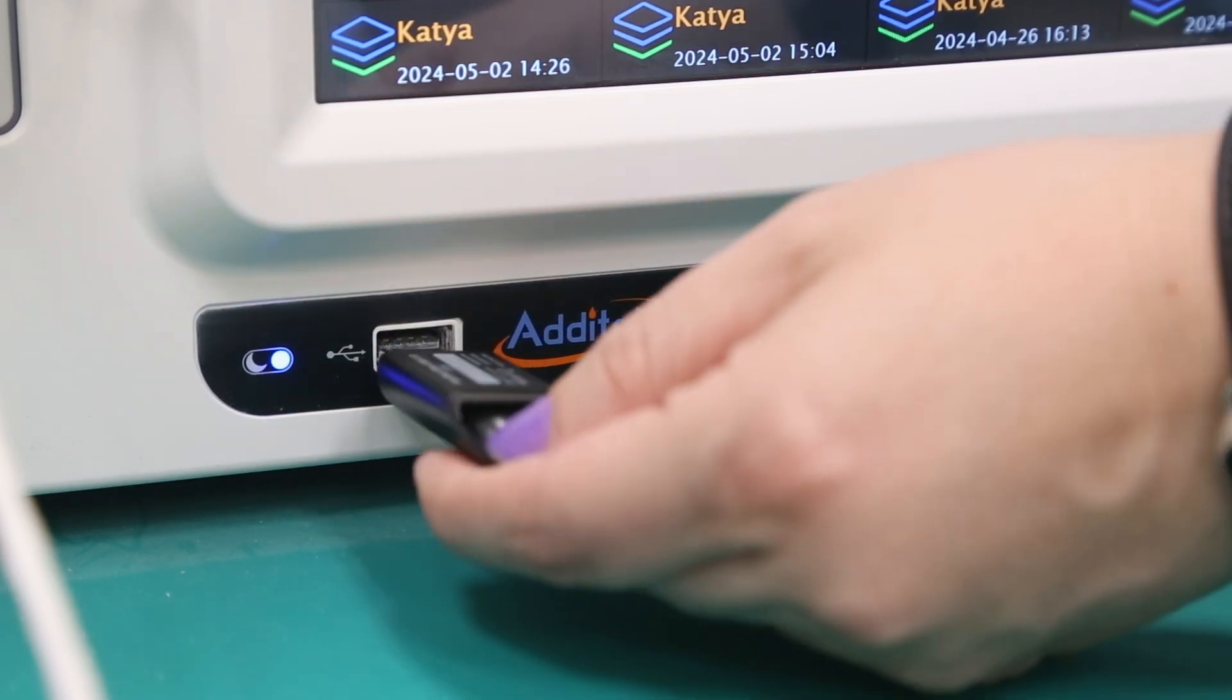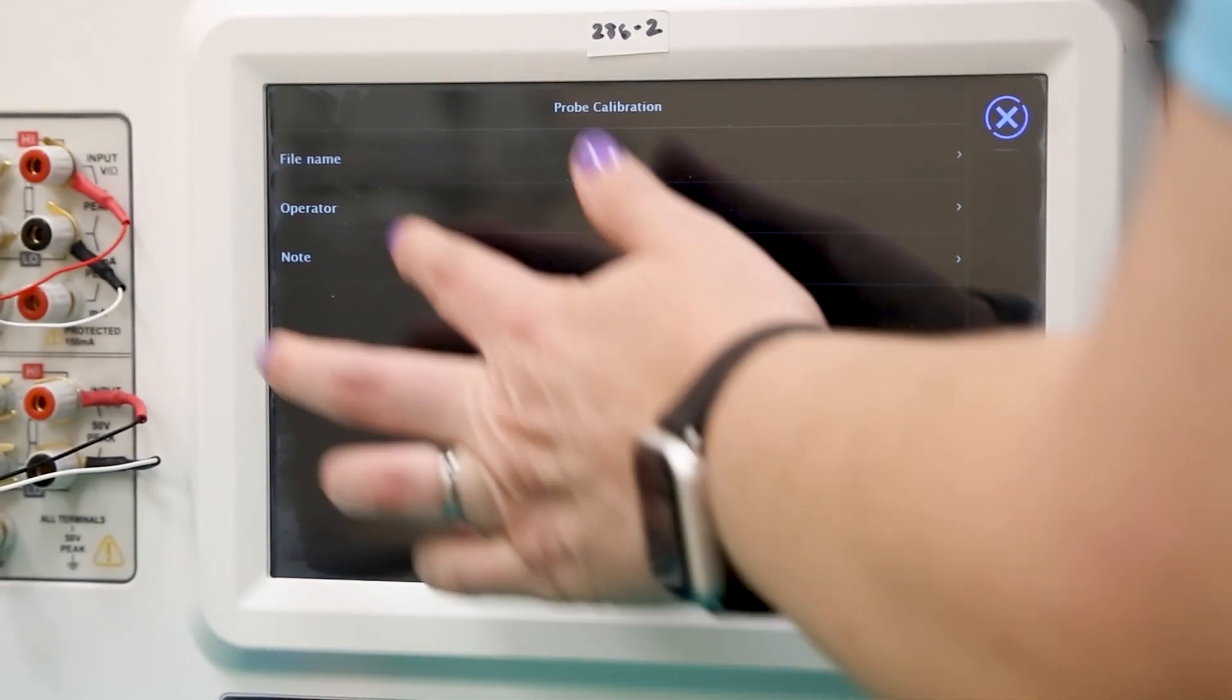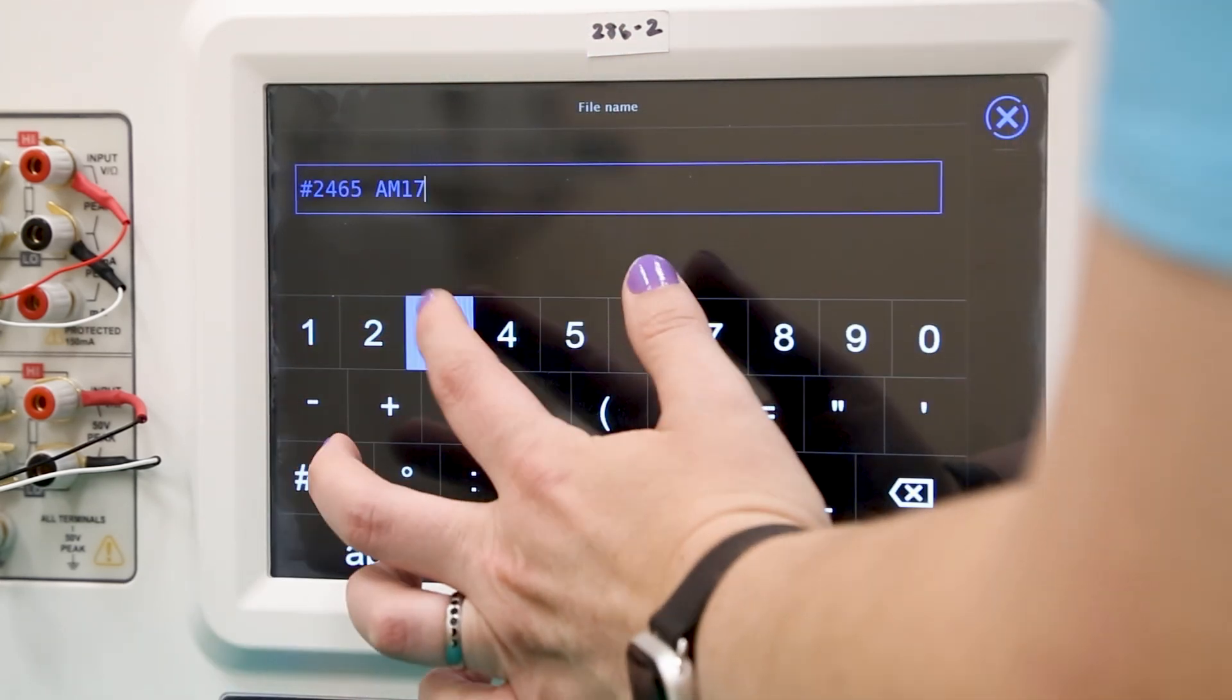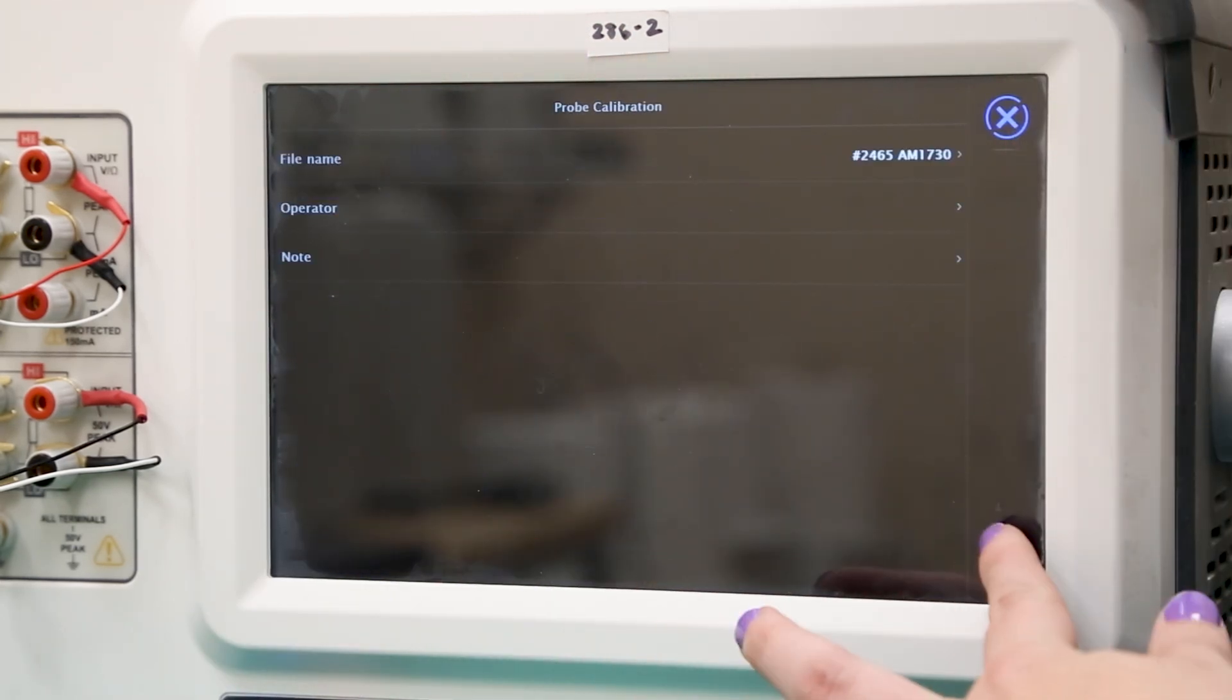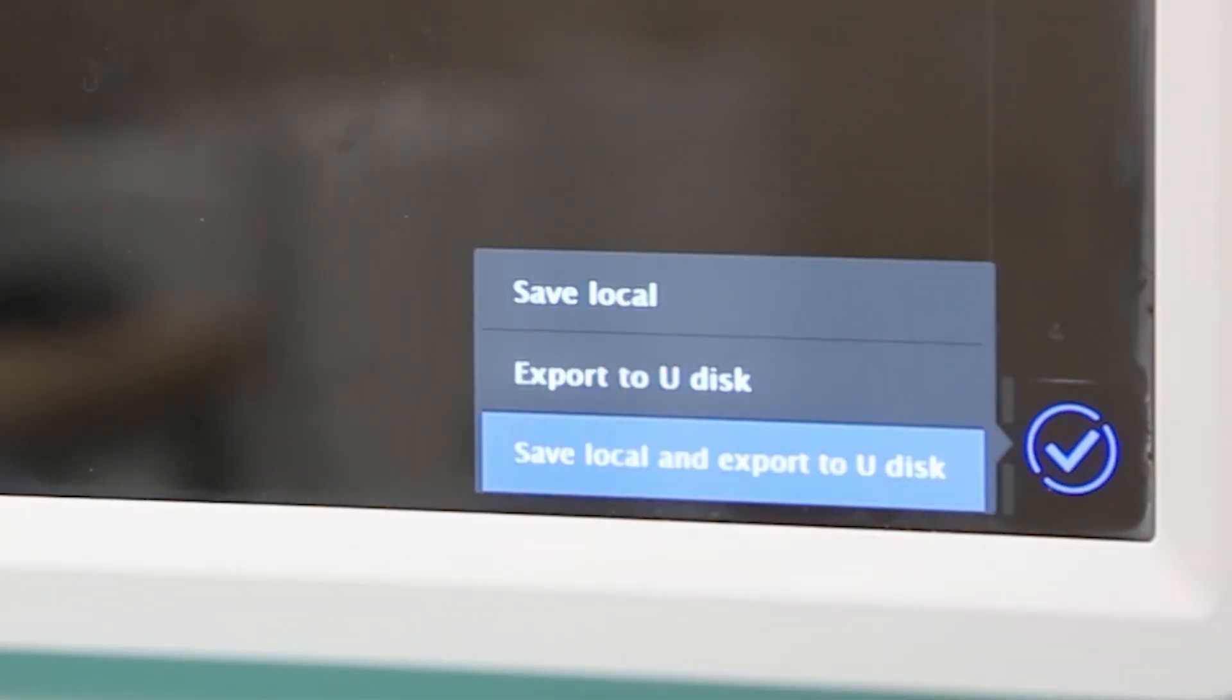These results can then be saved and exported by first inserting a USB drive, then pressing the save button. Here the user can enter the file name, the operator name, and any extra notes about the procedure, before exporting by selecting the save local and export to Udisk option in the bottom right corner.